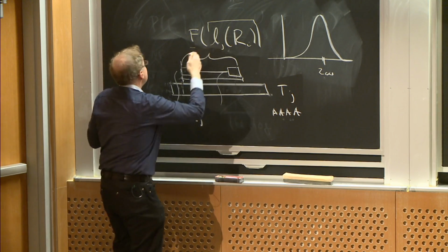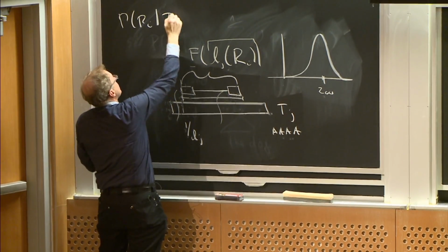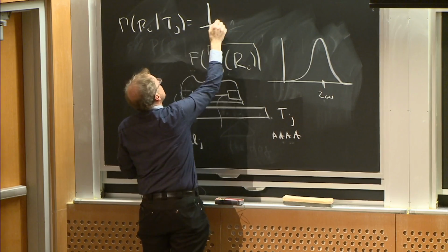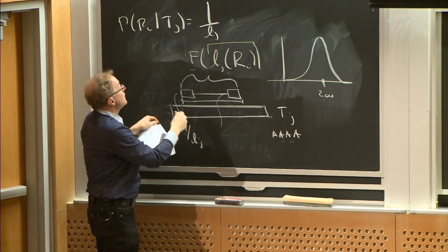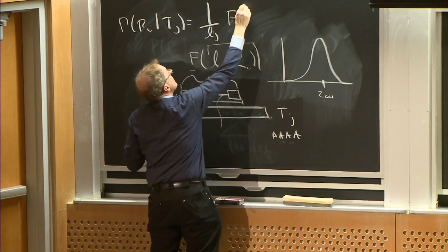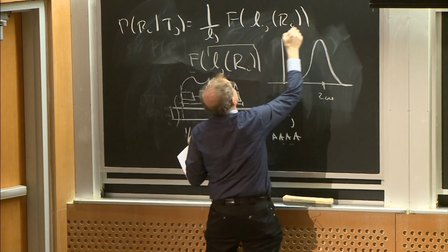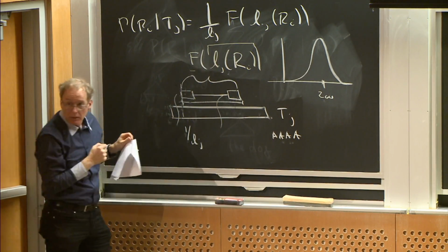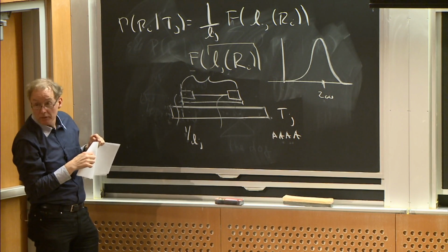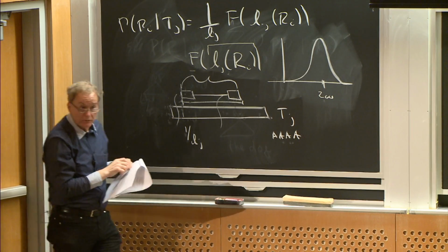So this term, the probability of the read given the transcript, is the component of where it's aligning times the likelihood that the implied fragment length agrees with what we think we have empirically. Okay, does that make sense? Okay, those are good questions.